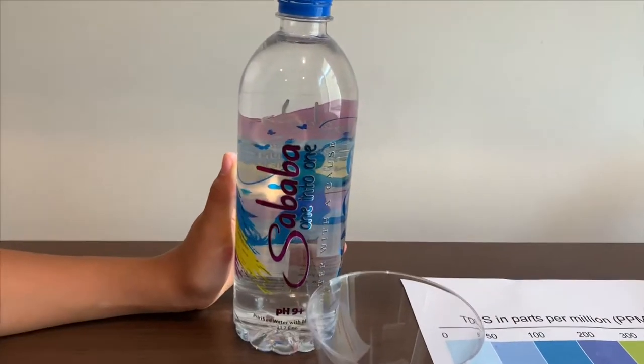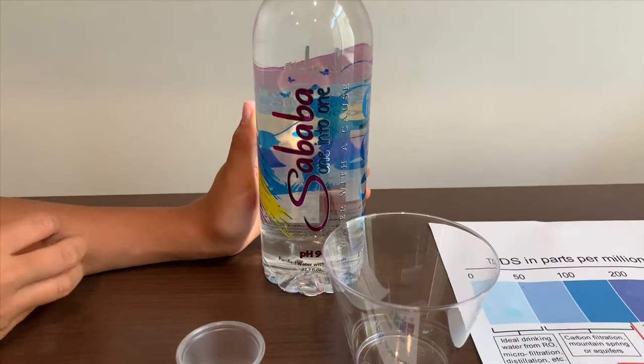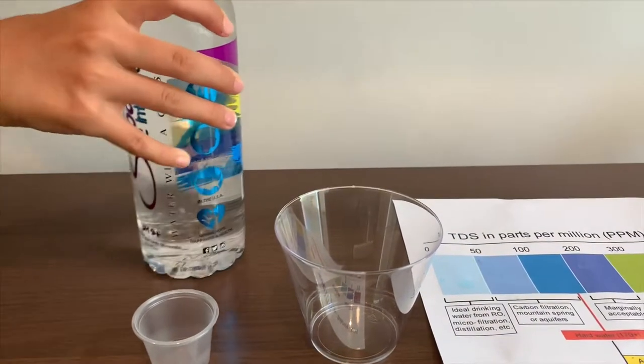This is all about purified water. It says its pH is 9 and it's $1.69. Let's open it and pour some water.